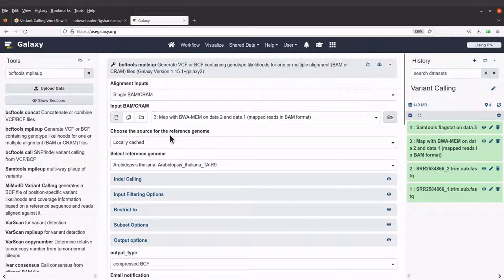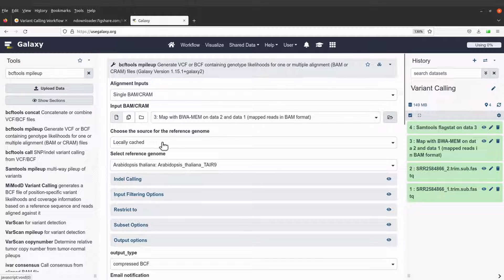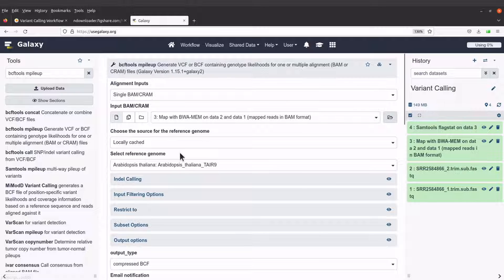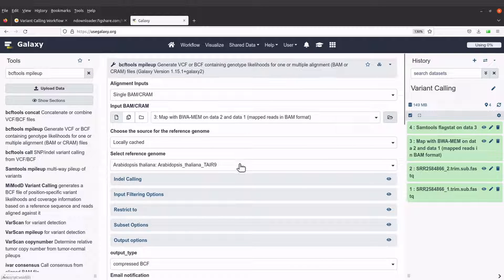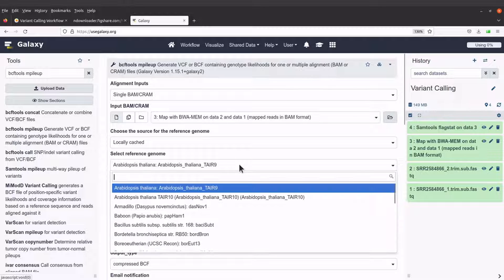Choose the source for the reference genome. Here we will keep it at locally cached and then we will come here to select the reference genome.